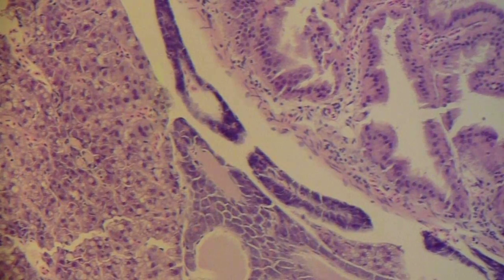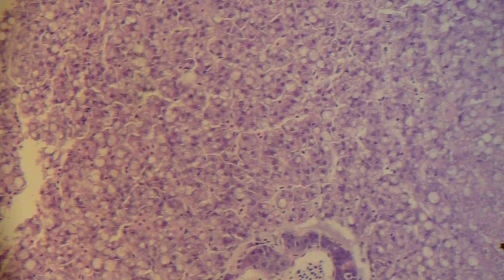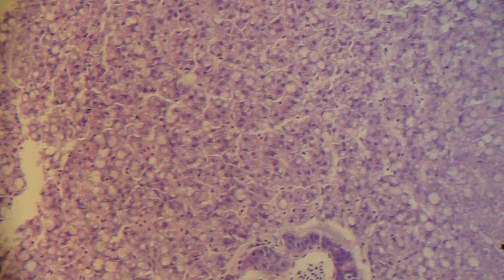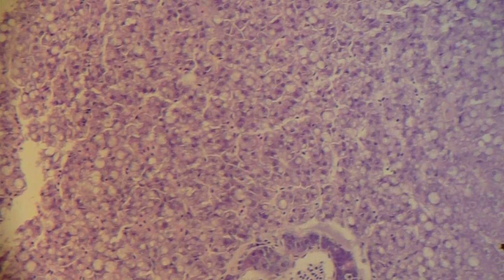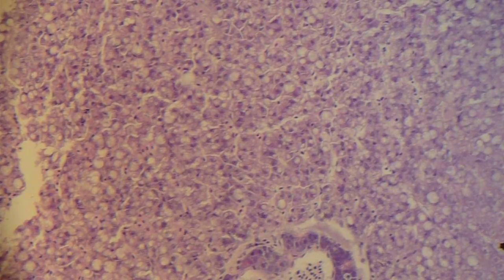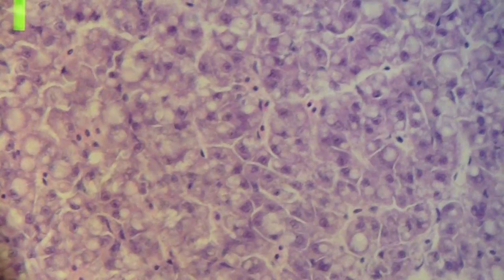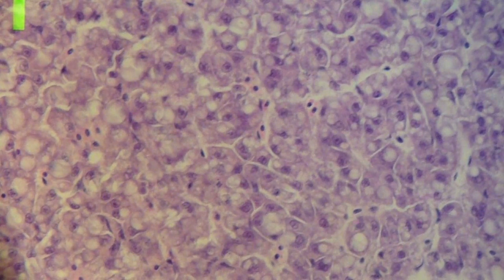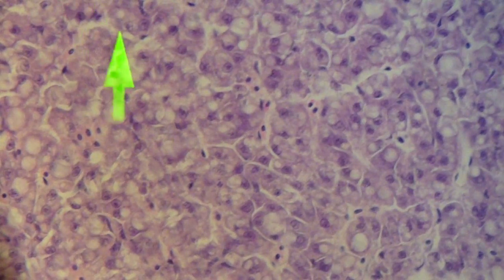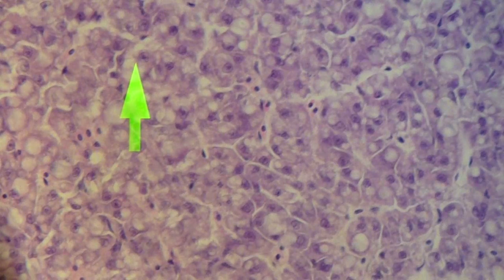If we then move on to the hepatocytes, which are the liver cells, you'll see that there's quite a variation in the vacuolation present in the liver cells. These tend to be macrovesicular cytoplasmic contents, and they tend to be lipid droplets. Zooming in closer, the vacuoles are quite fuzzy, which is evidence that they're metabolizing the lipid, probably because the fish hasn't eaten recently.